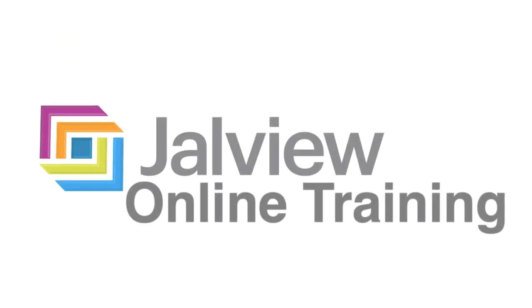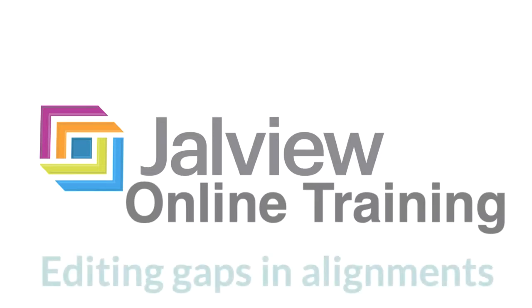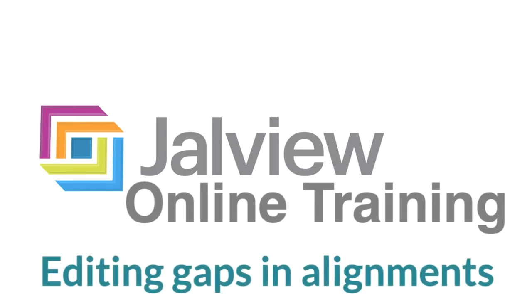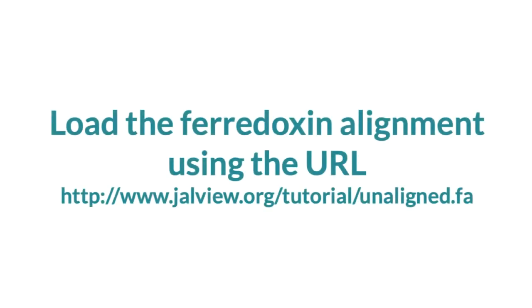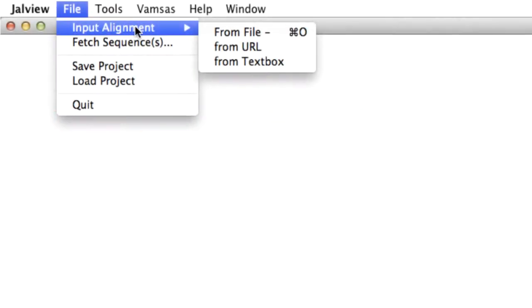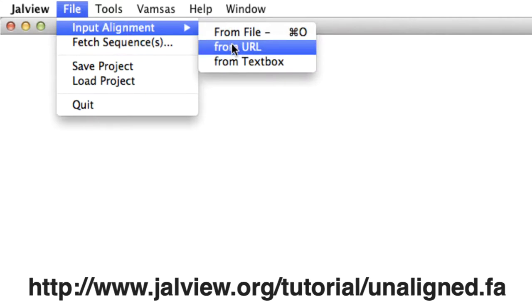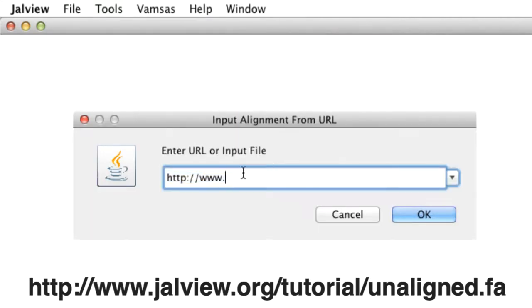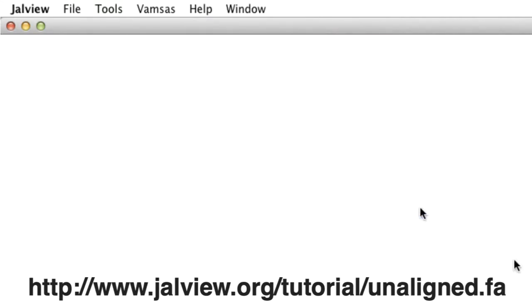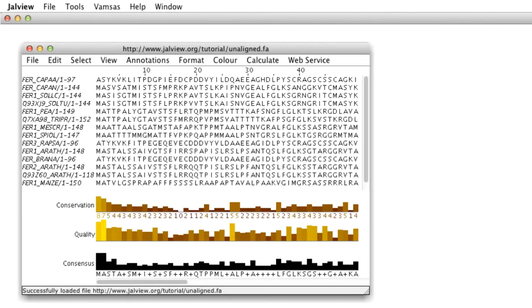In this Jalview online training video, I will be demonstrating how to edit gaps in your sequence alignment. I've already loaded part of a Ferrodoxin sequence alignment using the URL on the screen. This can also be found in the video description.